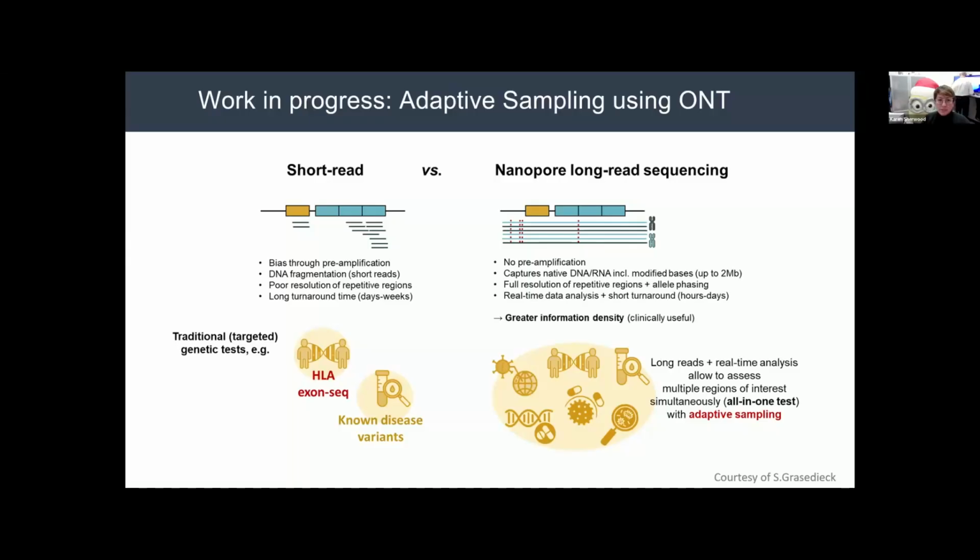So that brings me to a little bit of data that we have produced in that space. As I mentioned, long-read sequencing is now our routine HLA genotyping method. We use a Nanopore-based platform. It looks like whole genome sequencing could be, in the not too distant future, a test that is routinely done for patients. But there is an interim step in that space because there are some limitations still and obstacles that we need to be aware of if we decide to move into the whole genome space. So we've tried this approach called adaptive sampling. It is specific to the Nanopore-based platform.